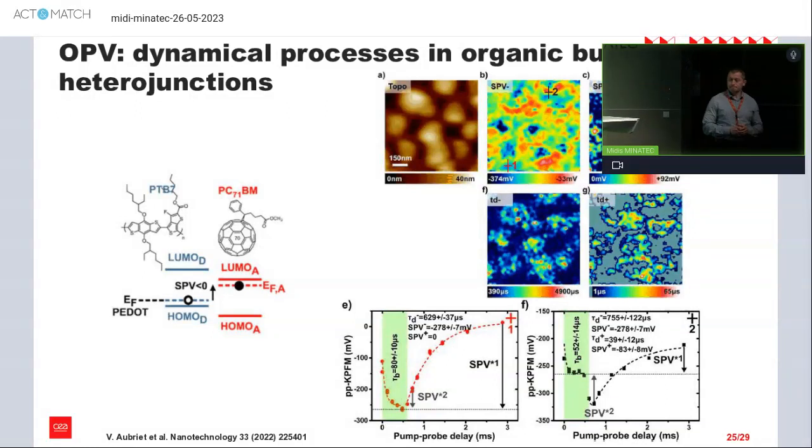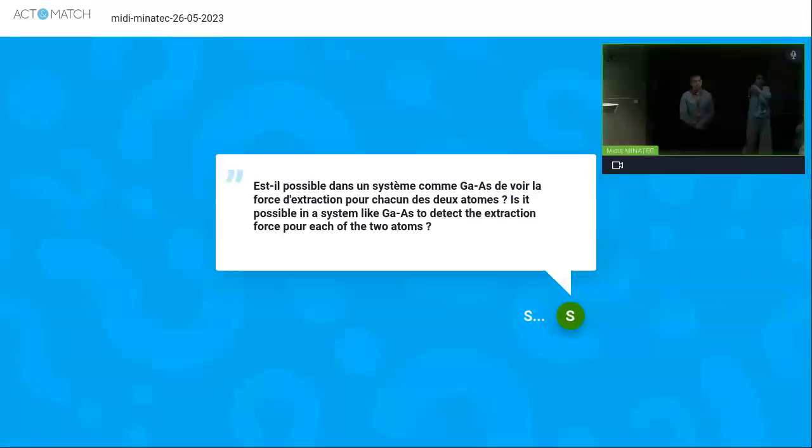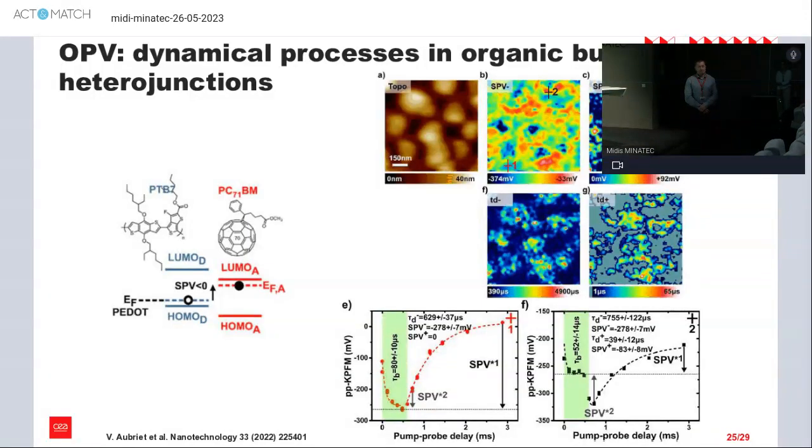Okay, thank you. Other questions, maybe? Yes, please. There. Hello, that's a beginner's question, beginner to AFM. Is the contact mode destroying the sample?